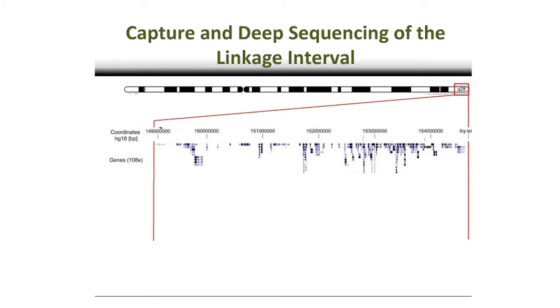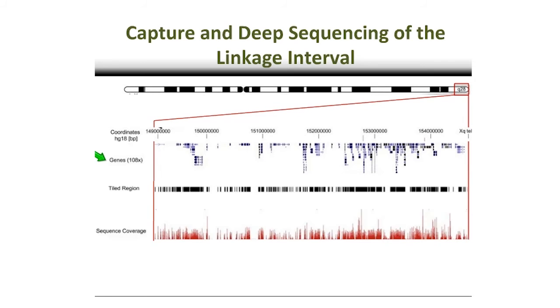It contains 108 genes, which are listed here. This is just the UCSC tracks. And what we decided to do was design a tiling array where we could capture these sequences for all of the coding and non-coding regulatory regions around these genes. That enables us to enrich the DNA many-fold over, so that when we're sequencing, we're only really sequencing the part that we've tiled.